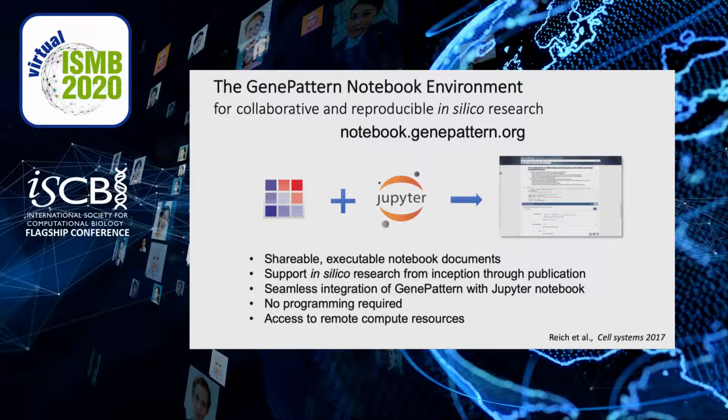This environment gives you all of the notebook features of Jupyter and is fully compatible with Jupyter and not a separate fork of the code. The GenePattern notebook environment adds the ability to utilize analyses from any GenePattern server in addition to a number of other general features to make it easier both for non-programmers to have access to the full range of genomic analyses required for today's integrative genomics experiments, and for notebook developers to make it easier for their own notebooks to be more accessible to users at all levels of computational sophistication.